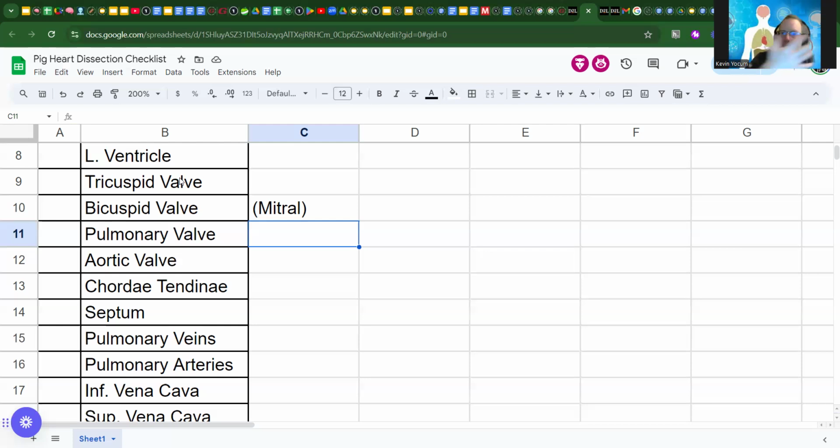We want it to go forward, not backwards. So the tricuspid and bicuspid valves are closed when we eject blood from the ventricles. Valves prevent backflow. We'll see that the valves are connected with some special cords, so we'll see the cords, the tendons, in there as well.